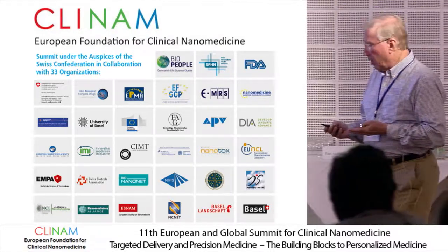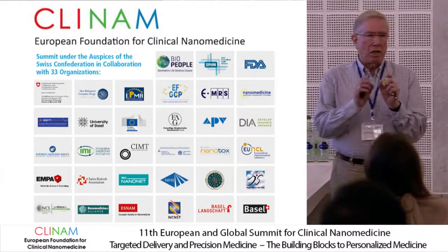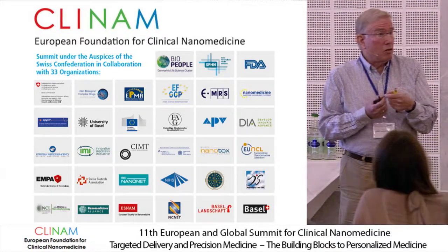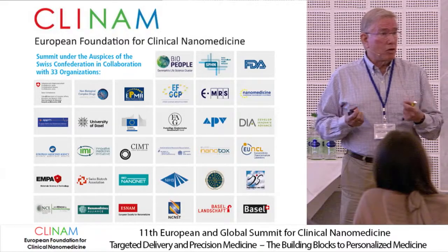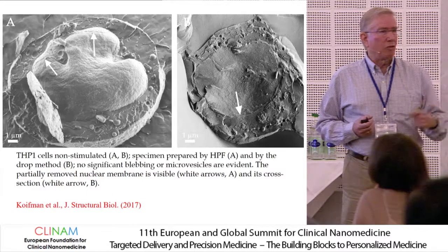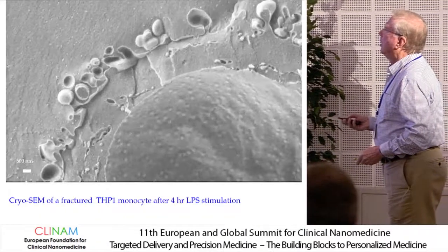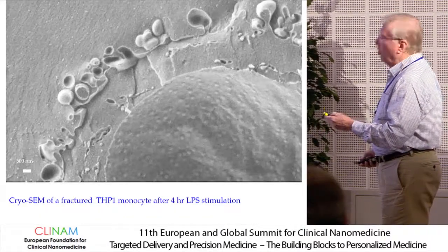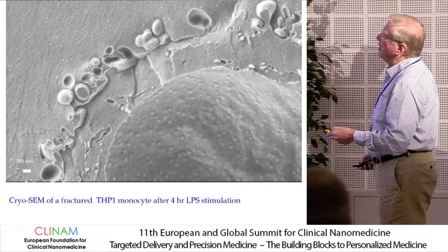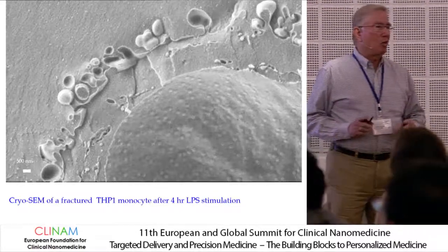Basically, what we see are little blebs that are still connected to the inside, and then the neck closes. So this is really like any other process where vesicles are blebbed from the cell. Okay, so basically there are really no holes here. You see, once they are about to leave, the neck actually closes. I don't think there is a hole, as much as I can tell.